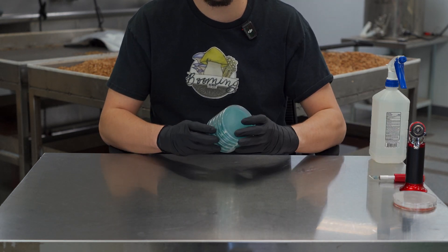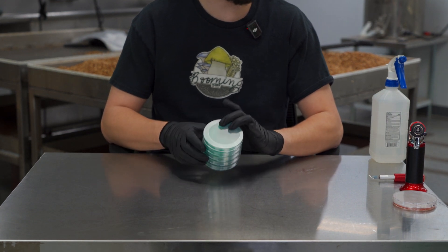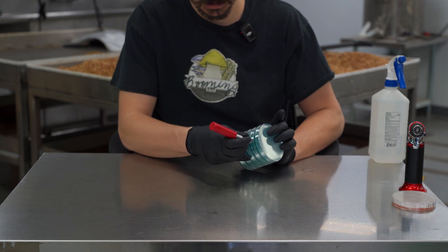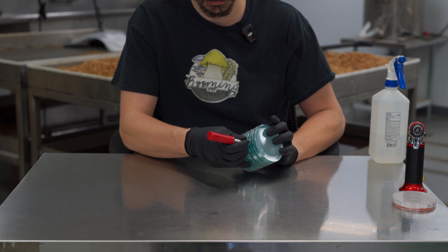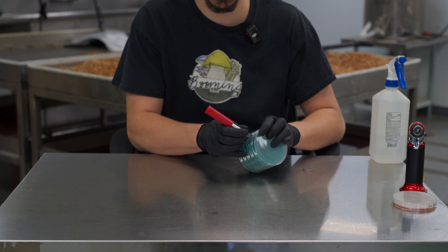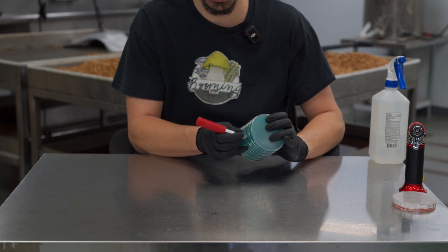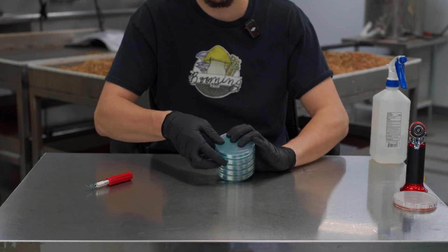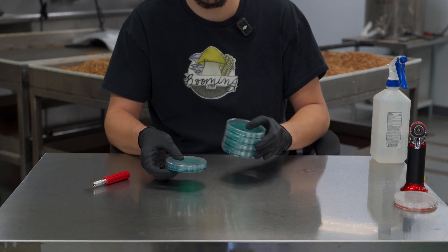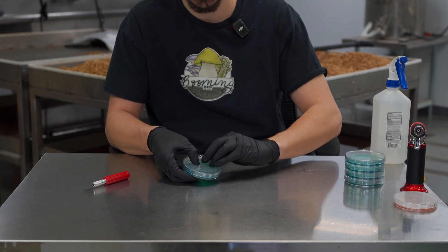Demonstrating how to open our petri dishes — they are heat shrunk. The easiest way to remove a plate is to take a clean exacto knife, insert the blade at the bottom of whichever dish you're trying to get out, and just move the blade along, rotating the dishes. Once you go all the way around, the top dish comes off and the bottom dishes stay on. Remove the heat shrink.